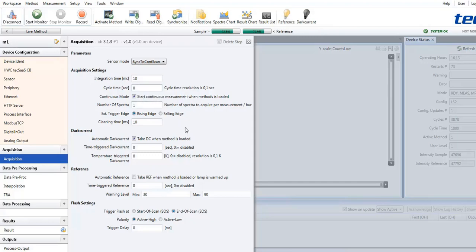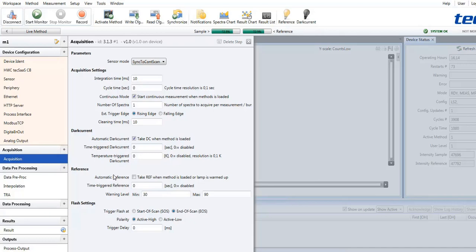Next, the parameters for dark current correction are selected. How often is dark current acquired? Is it acquired automatically?